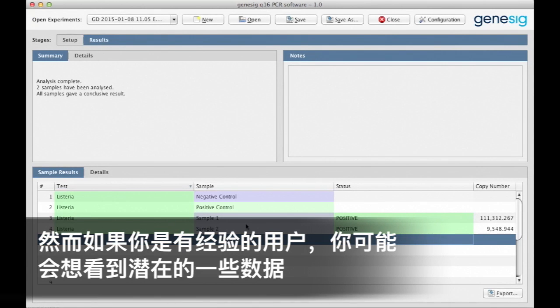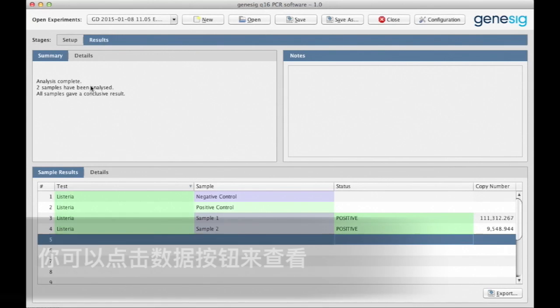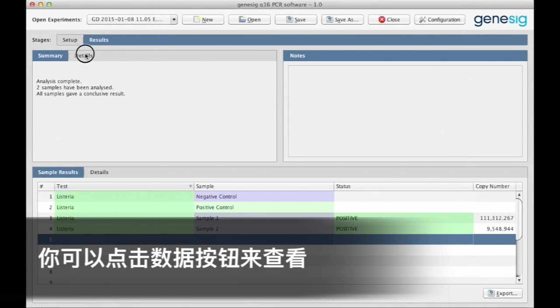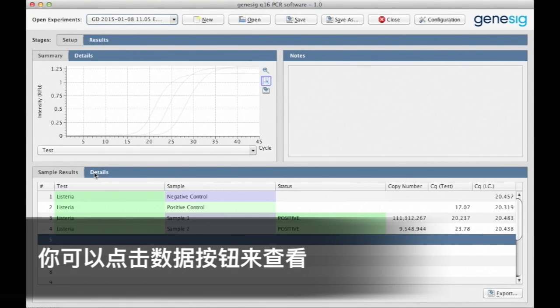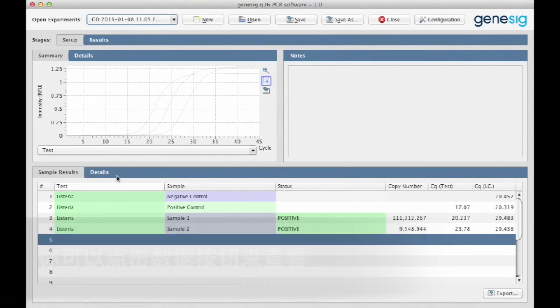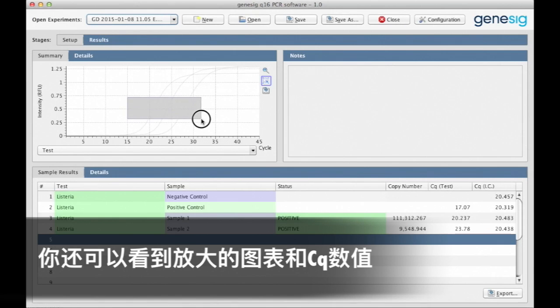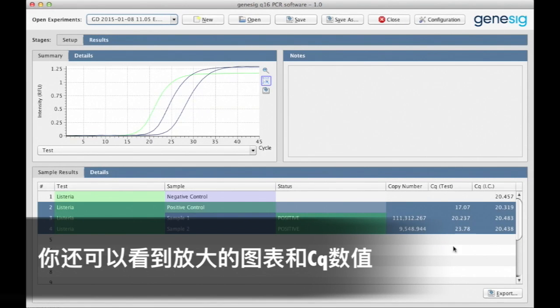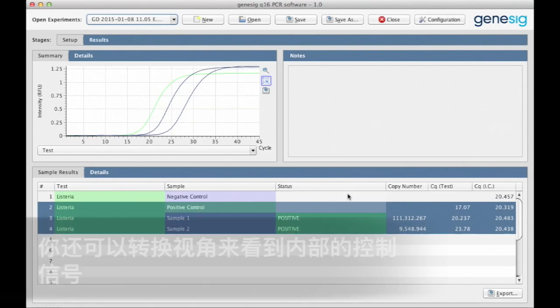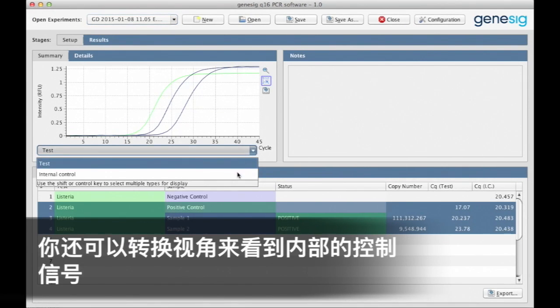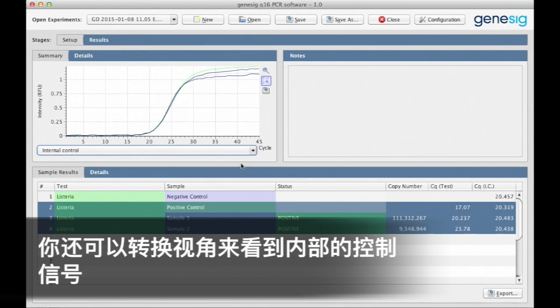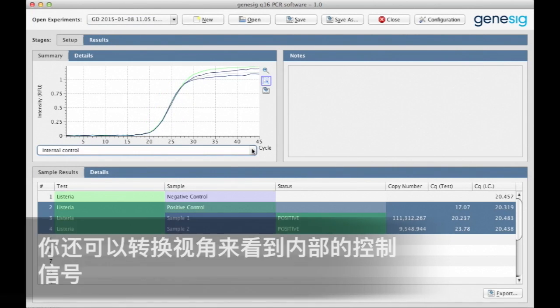However, if you're an experienced user and you would like to see the underlying data, you can see all of that by clicking the details tabs here and here. So in this view, you can see the amplification plots and the CQ values. You can even switch between the views to see the internal control signal, if you like.